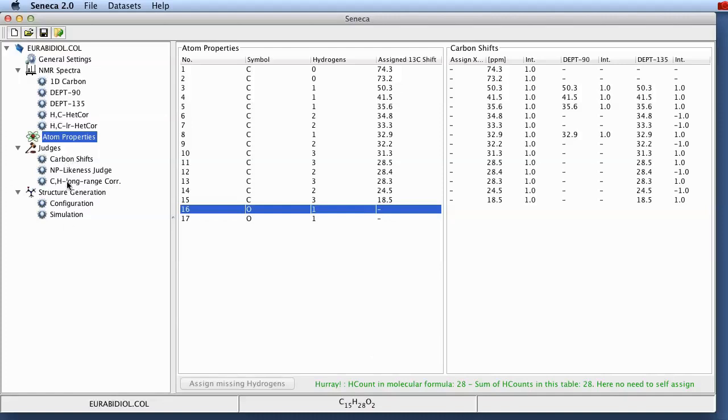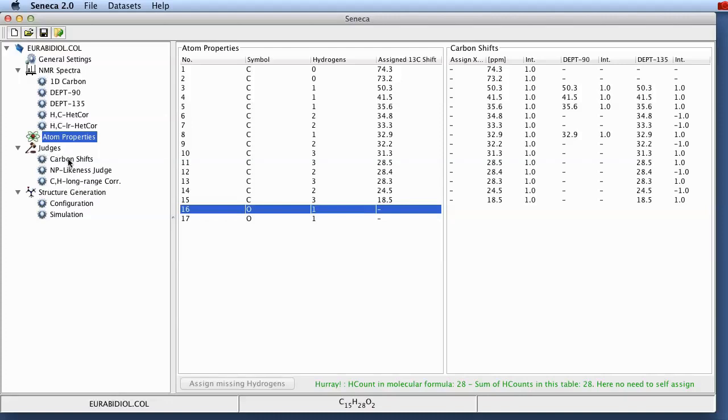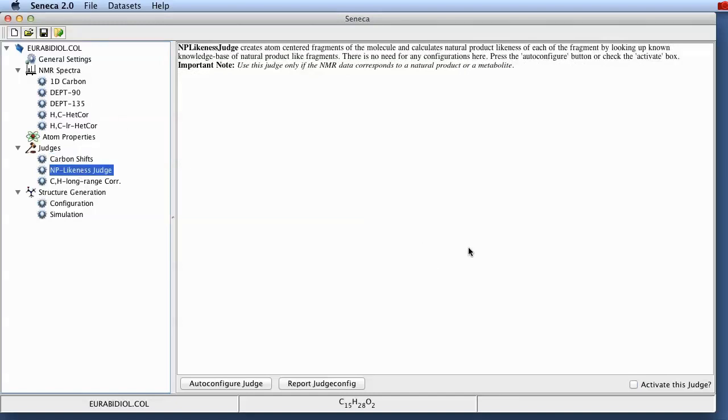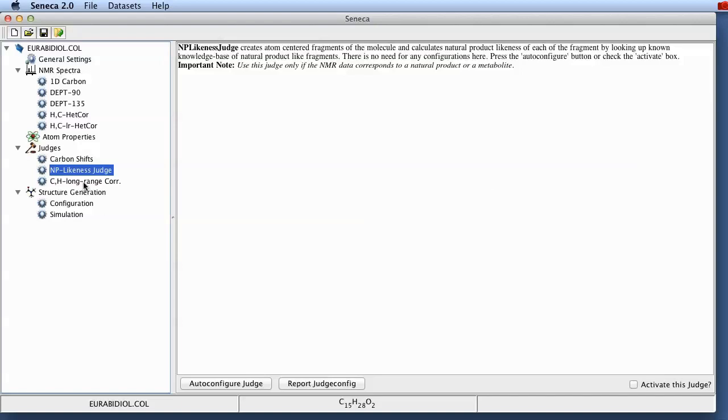And for this judgment we have the different judges which contribute to the target function of Seneca. For example here we've got the carbon shift judge which checks if the hybridization state of a particular carbon atom is within a certain range. Within the measured range given by the 1D carbon spectrum. We then have a natural product likeness judge in this particular case here which is in this case not enabled. I'm not going to go into the details because this is still work in progress.